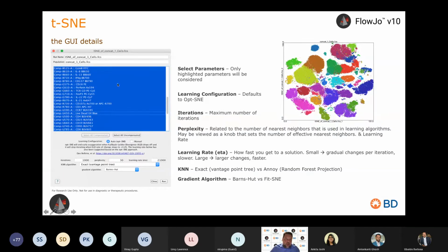But all the other markers here are phenotypic markers, and I want to include them. But if you gated down, say you dumped your CD14s, you dumped your B cells, and you're just focusing in on a lineage, well, then in that case, I might not include the lineage markers that we've already gated away because they don't add any discriminating information into the system.